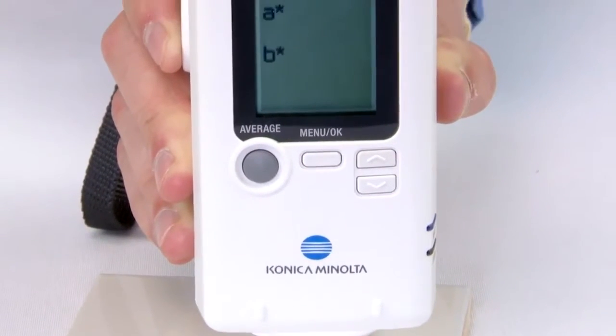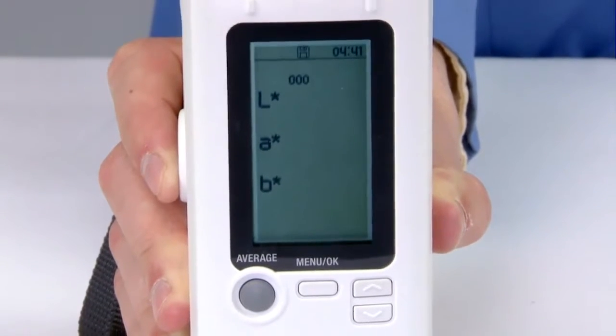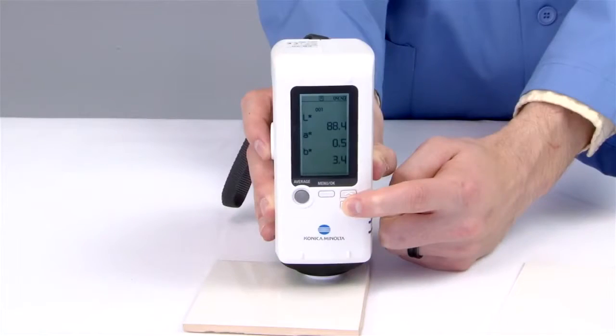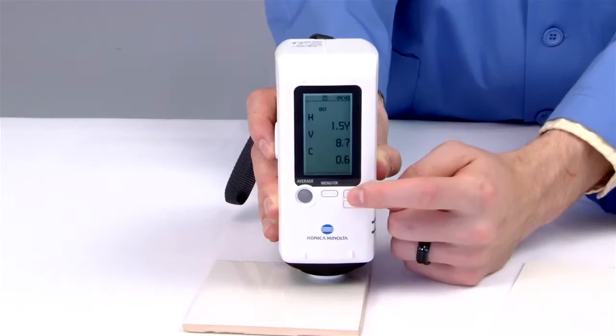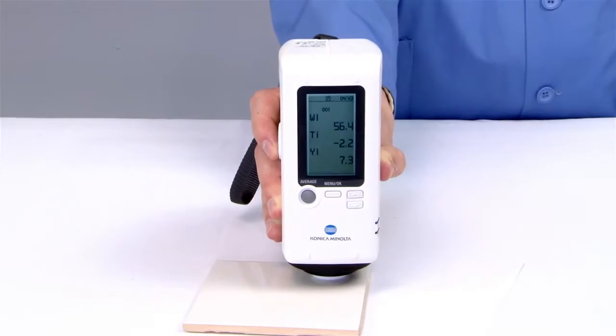Display measurement results from one of eight color spaces, including LAB, LCH, YXY, Munsel, whiteness, tint, and yellowness.